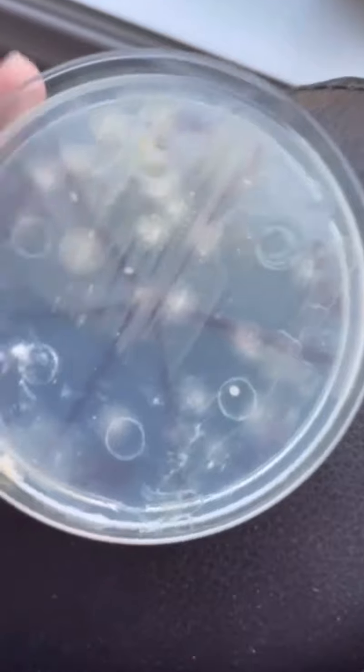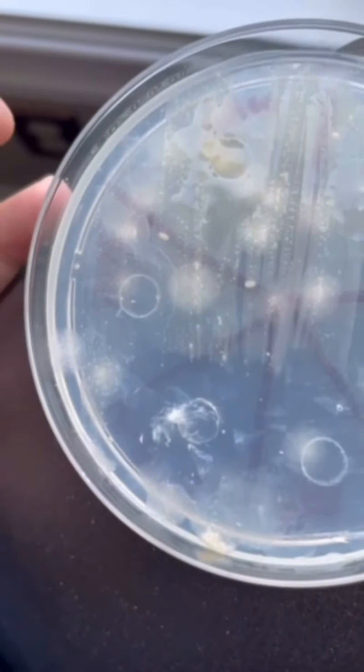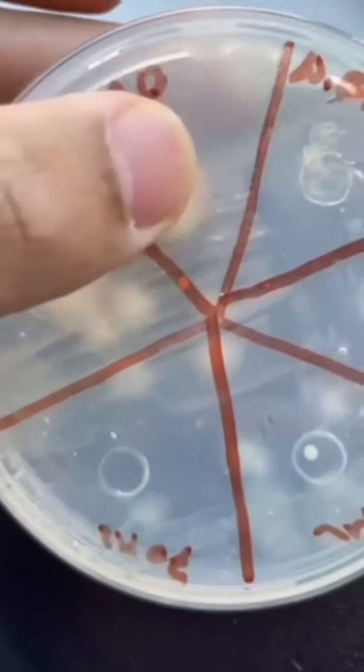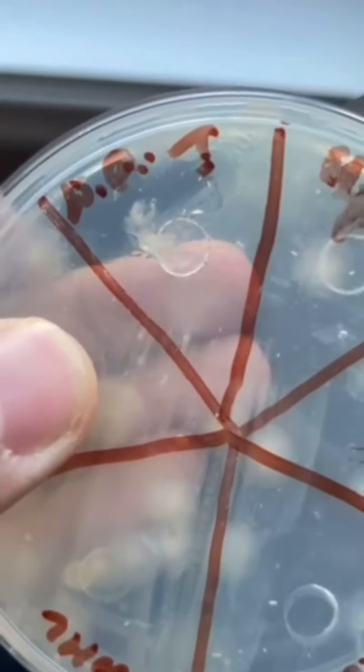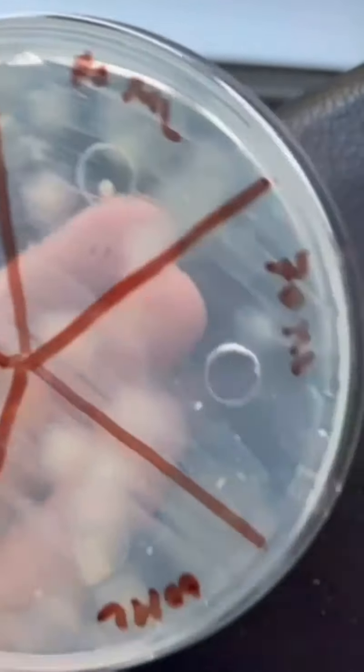Nothing grows on these 3 quadrants, but on these 4 quadrants there's growth of microorganisms. This one is the 60, and there's growth on 60. On the H2O side there's also growth, and on the without active ingredient there's growth, and on the market made there's no growth.